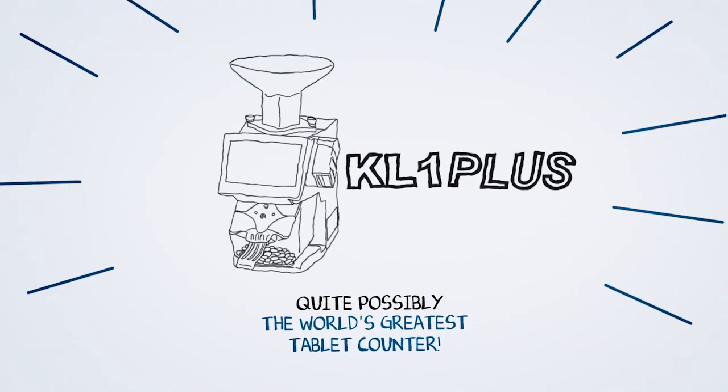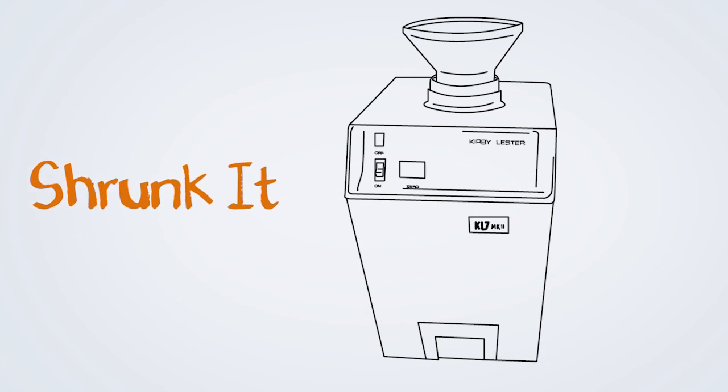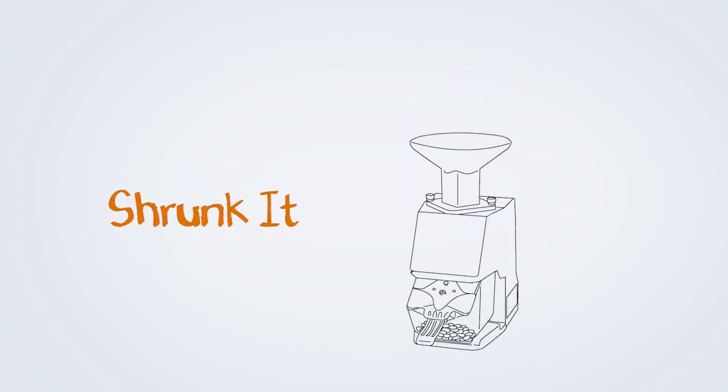Introducing the KL1 Plus, quite possibly the world's greatest tablet counter.